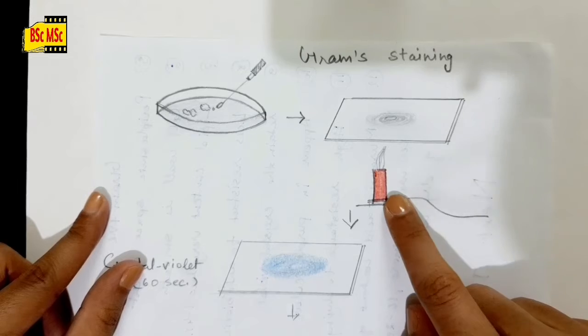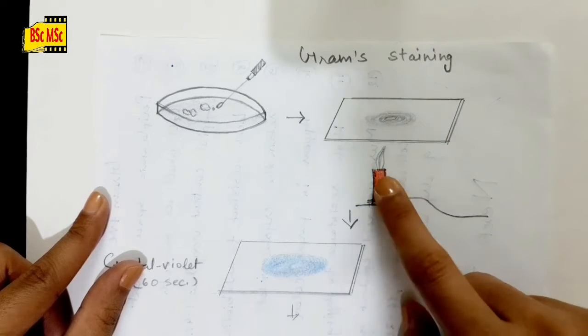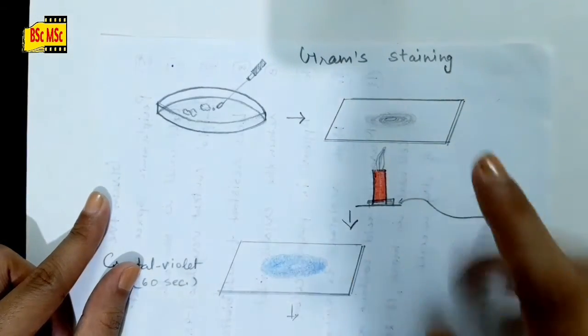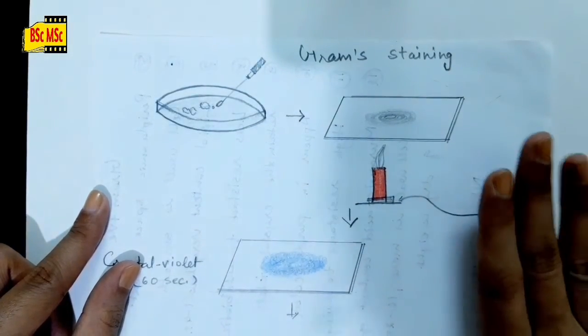Don't do it continuously. Do it for just 5 seconds, then remove the slide, then again do it for 5 seconds, then remove the slide. Okay, do it like that.